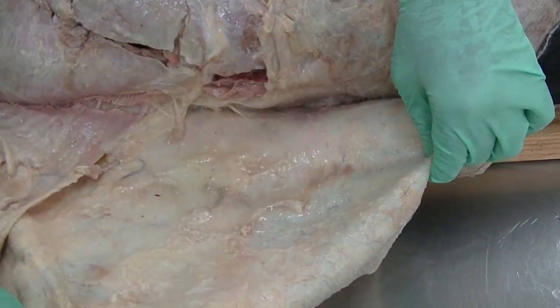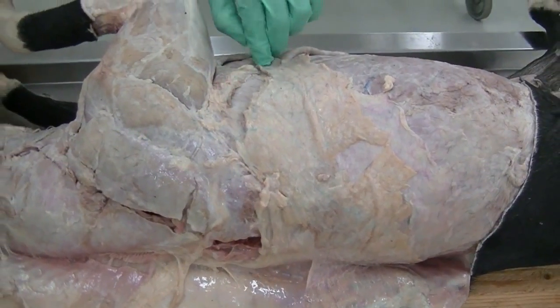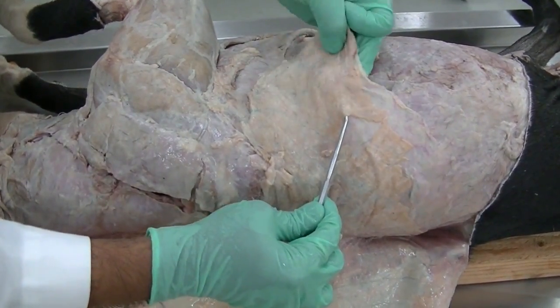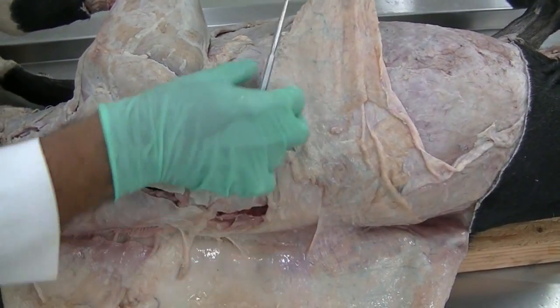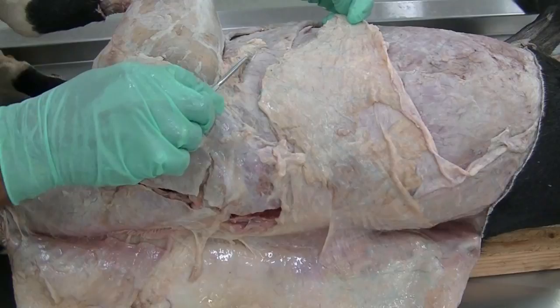We have part of the cutaneous trunci, which is the superficial muscle of the trunk, which basically is present between the two layers of the superficial fascia, which can be seen here, with some fat deposited on both sides, so the muscle is completely present within the superficial fascia. So that is your cutaneous trunci, which has been transected here.